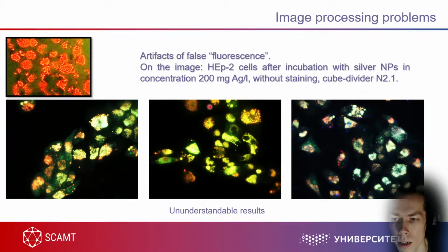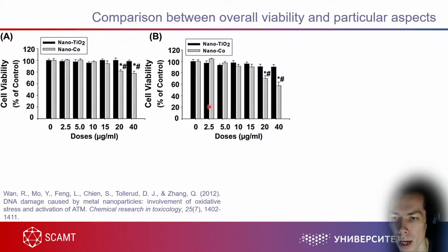The same in, for example, acridine orange. If you see that the nuclei of your cells stained with acridine orange are red, it means that DNA undergoes some damage. So DNA should be stained in green, and the nucleus of living cells should be stained in green. If the nucleus is stained red, there is damage to the nucleus, it's single-stranded DNA, and probably the cells undergo apoptosis.